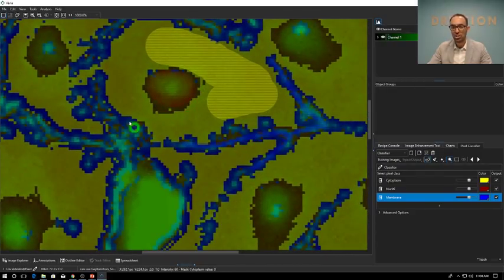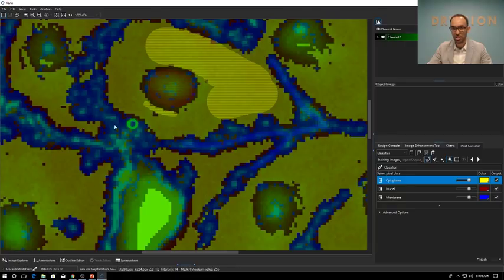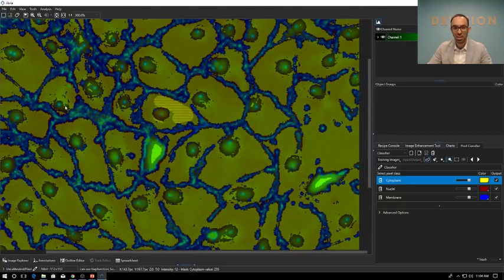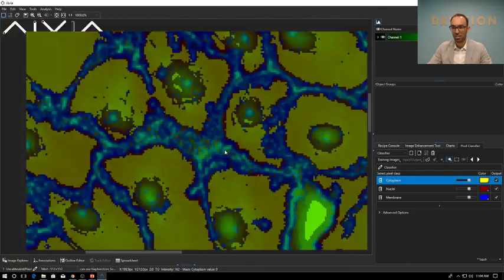I will teach it a little bit more so you see how it behaves. So I'll say that this is actually cytoplasm, and it will try to adjust. That's already pretty good. I don't really need additional teaching, I don't think. You can see that's what it looks like.